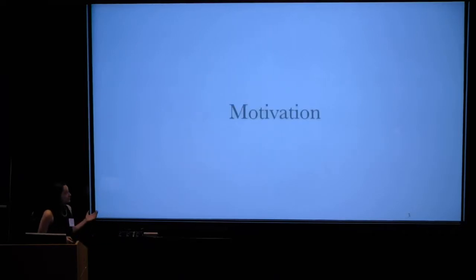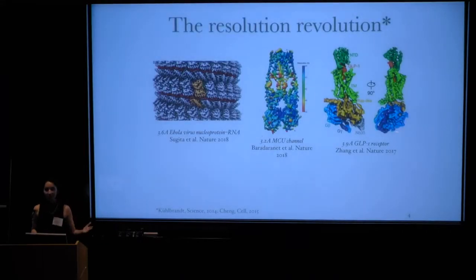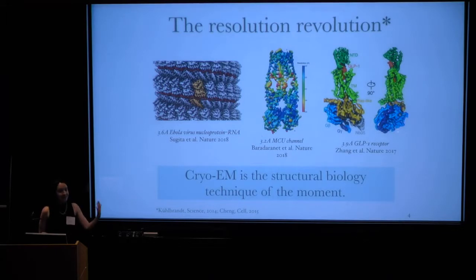So, the motivation of our work. As we saw in the morning, cryo-EM has revolutionized structural biology. You can now find cryo-EM maps at less than 2 Angstrom, and this is really amazing. Basically, cryo-EM is the structural biology technique of the moment, and it will be for many decades to come.